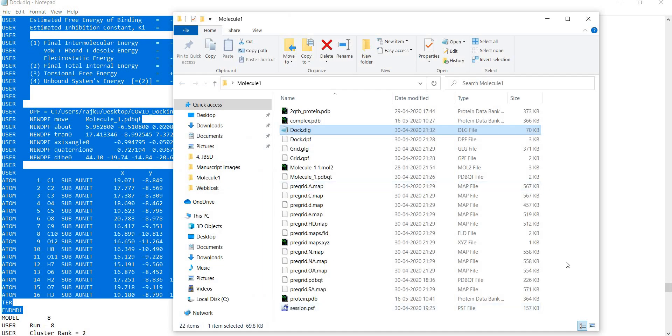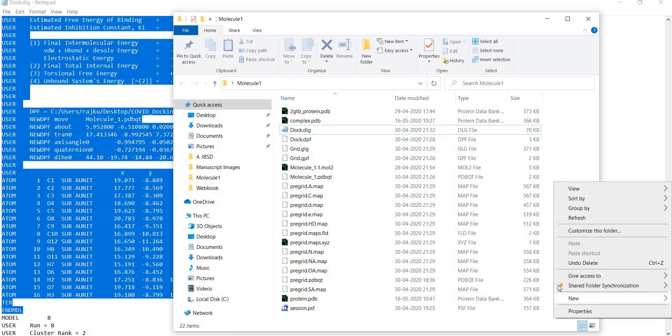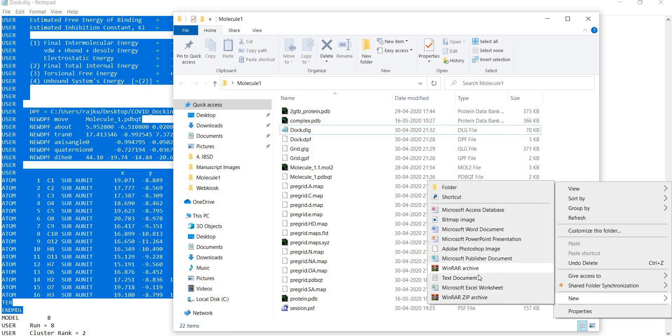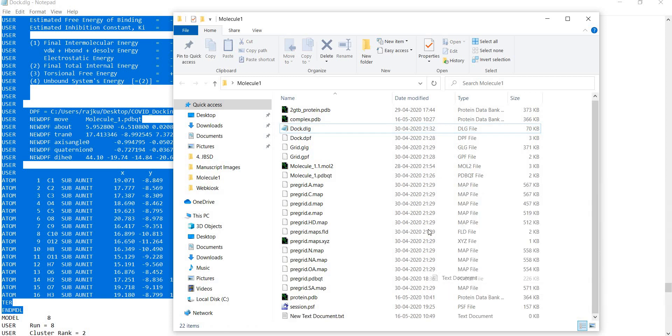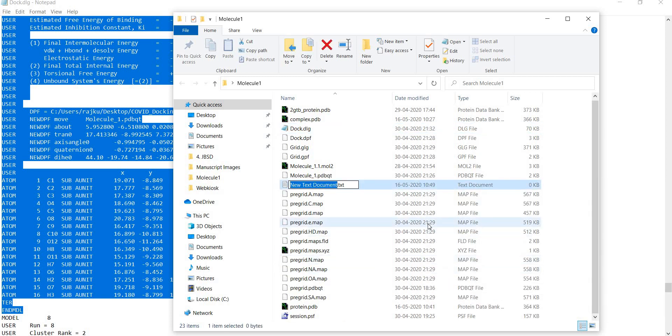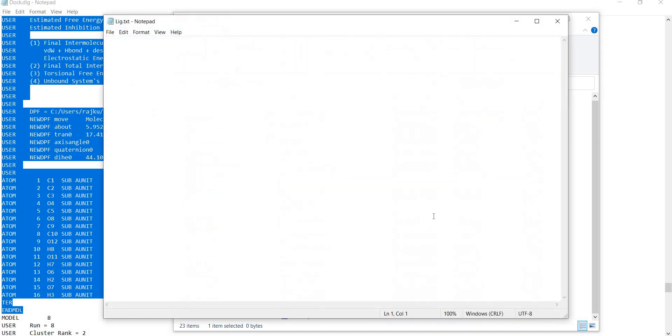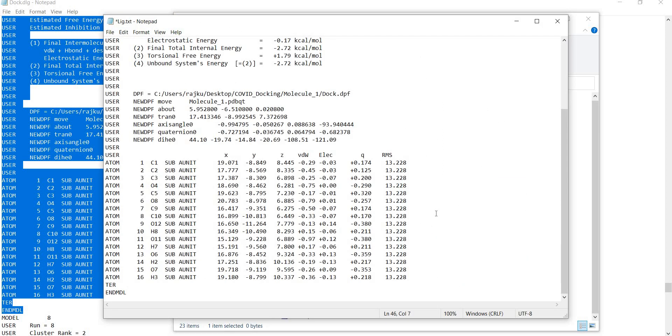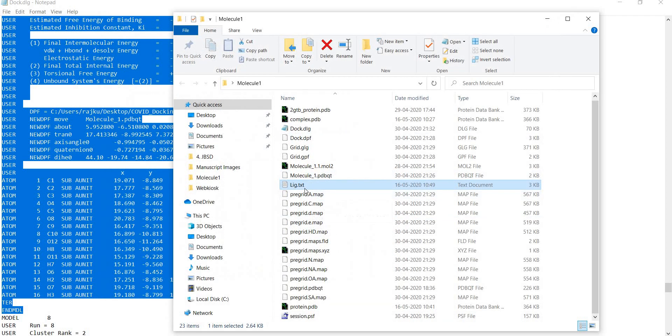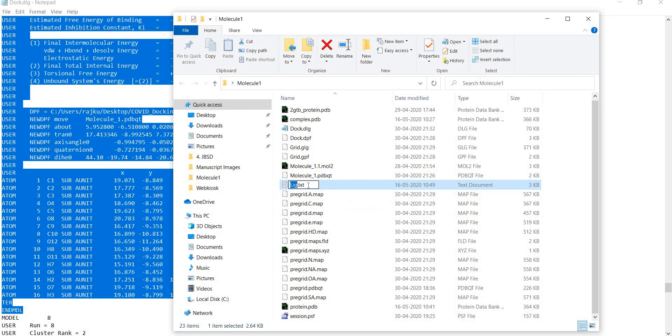I will go to the folder and make a new text file, name it as ligand, open and paste, and save. You can see the extension is .txt so I want to change it to .pdb.